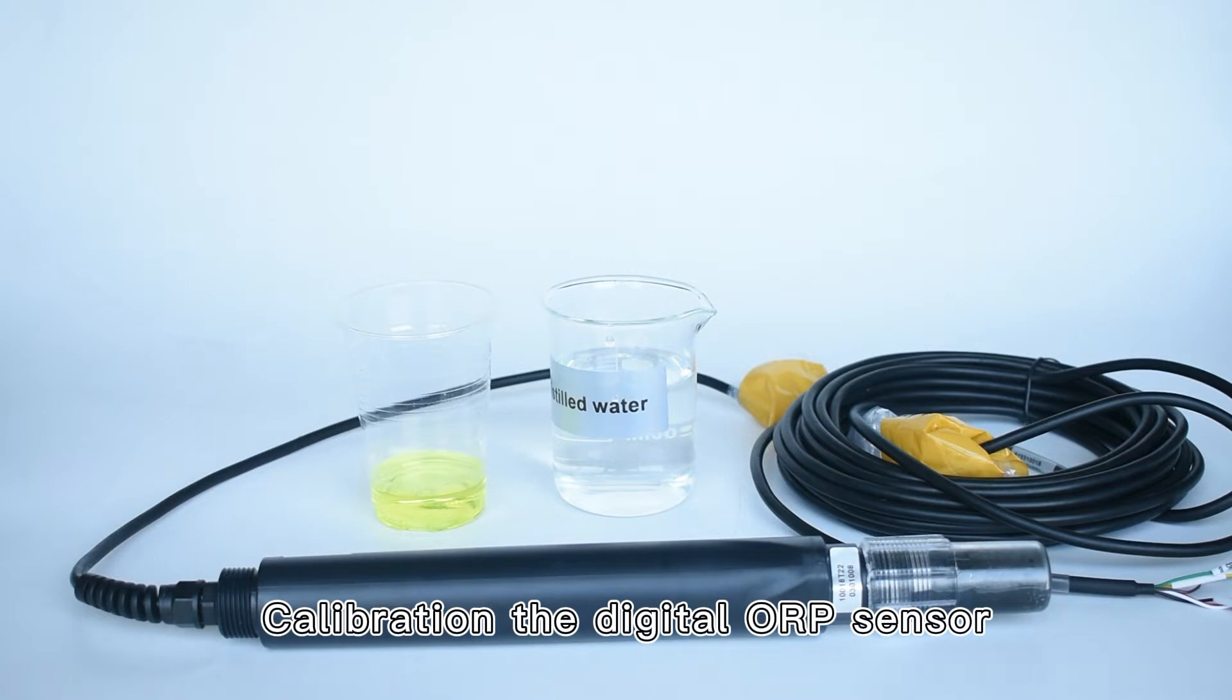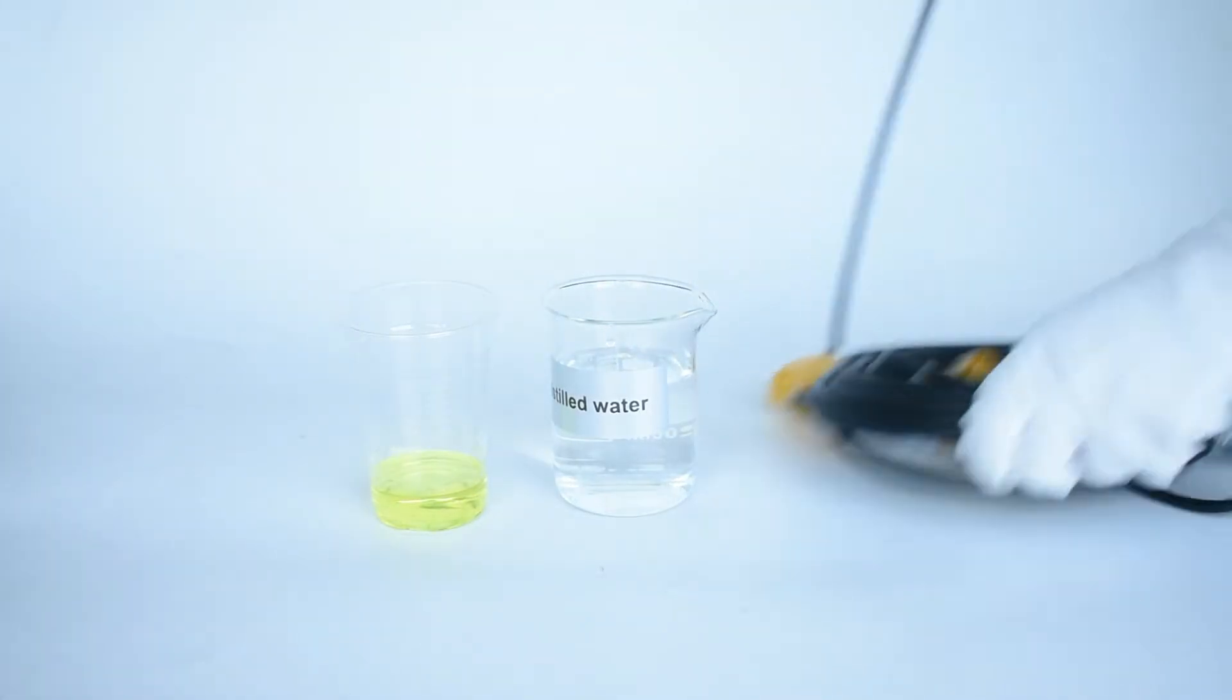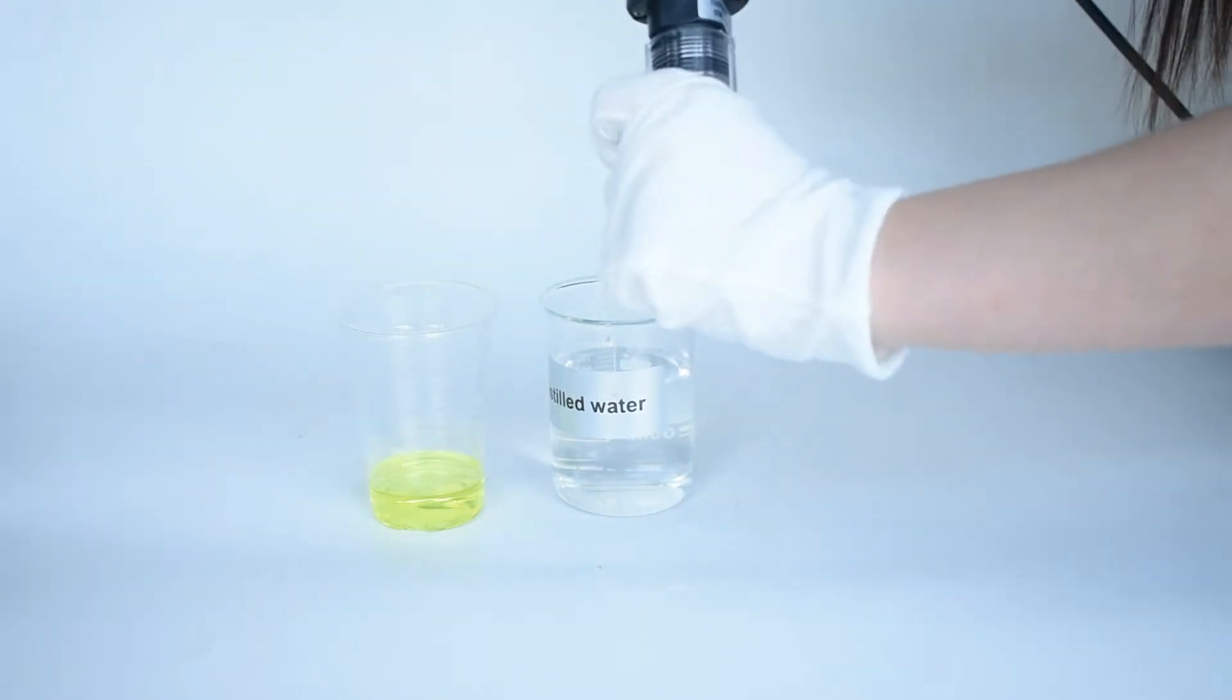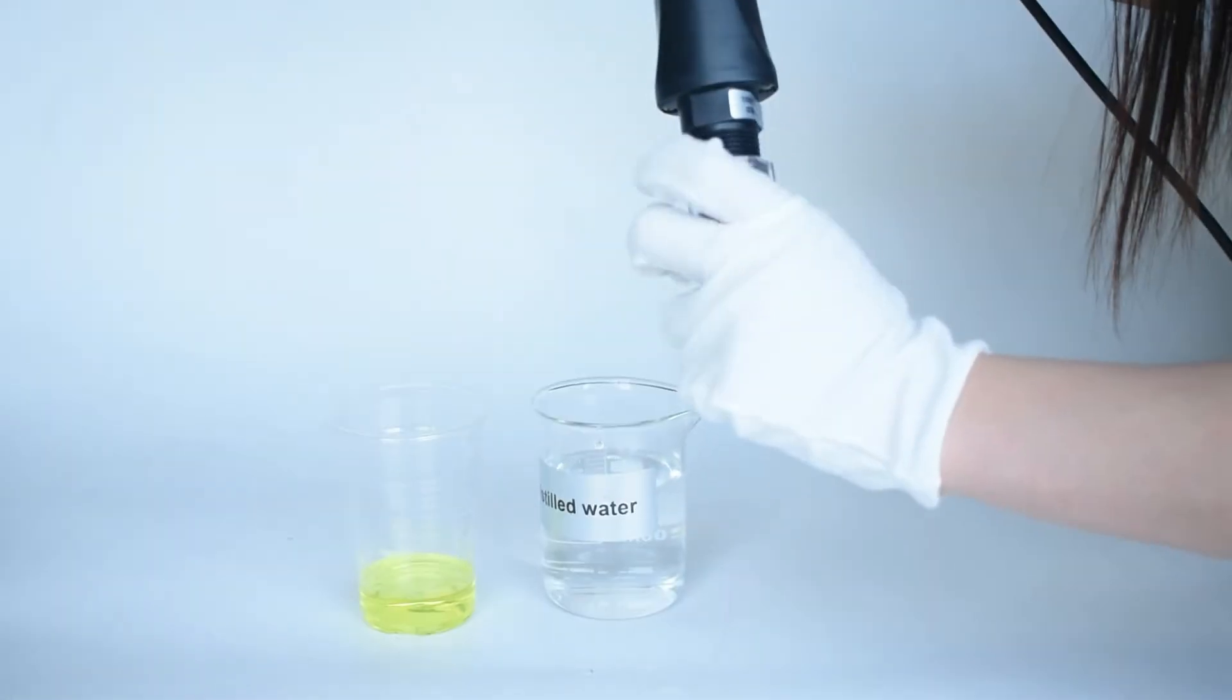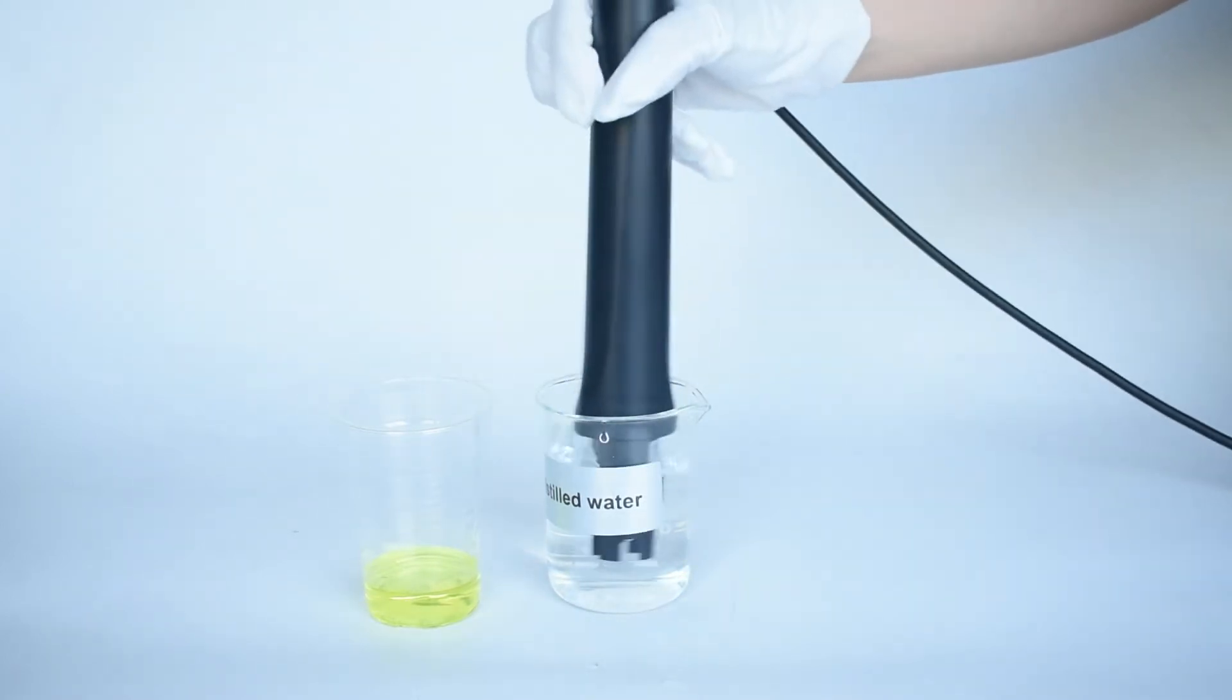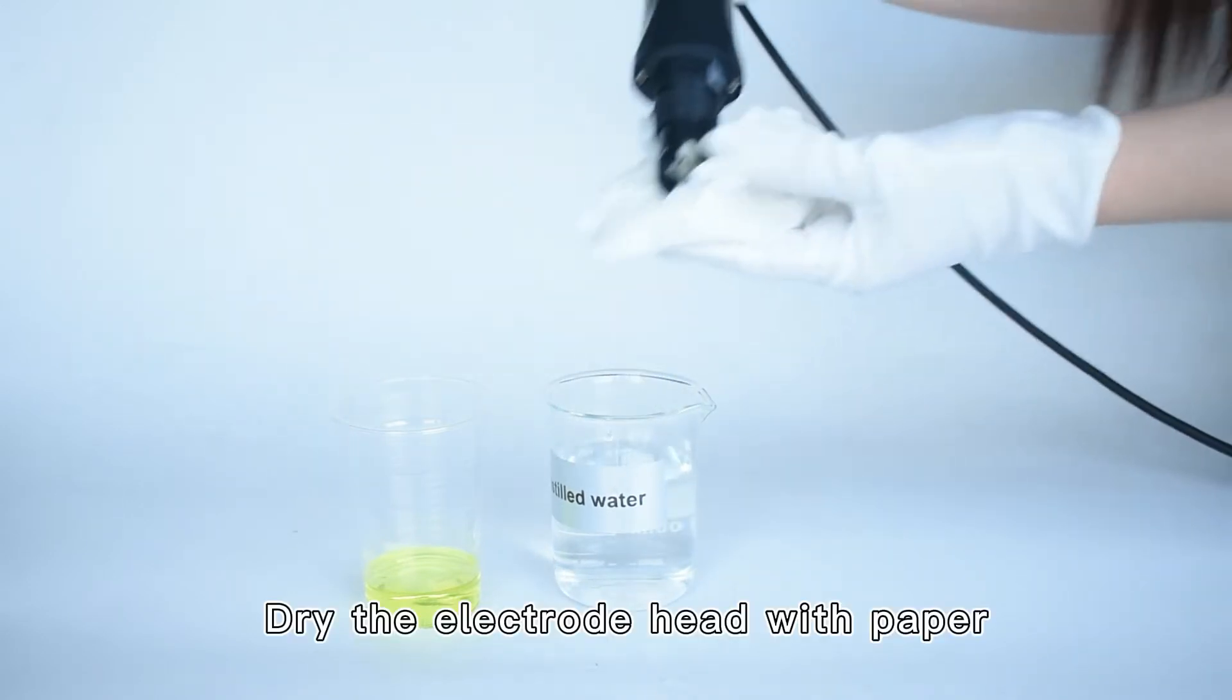Calibration of the digital ORP sensor. First, clean the electrode head with distilled water. Dry the electrode head with paper.